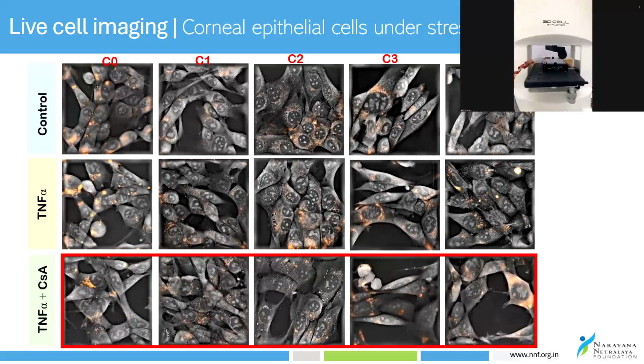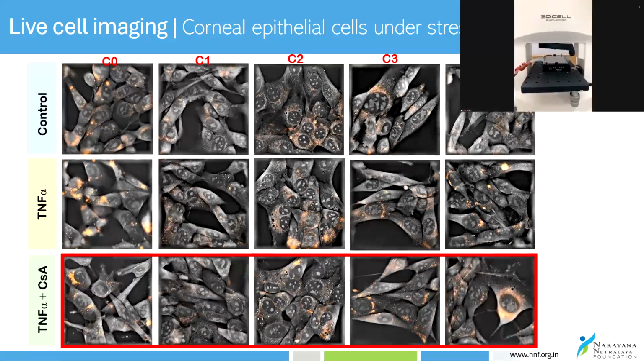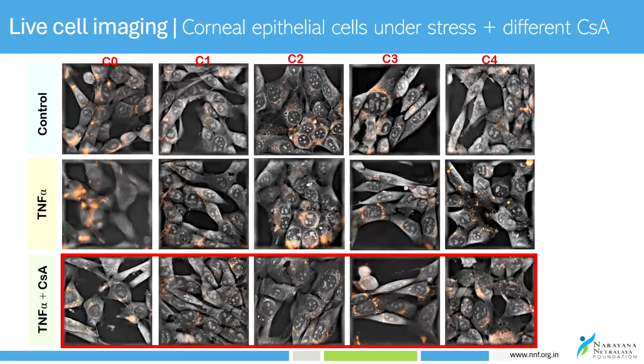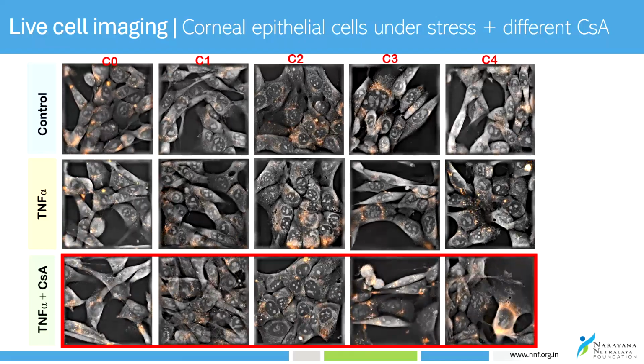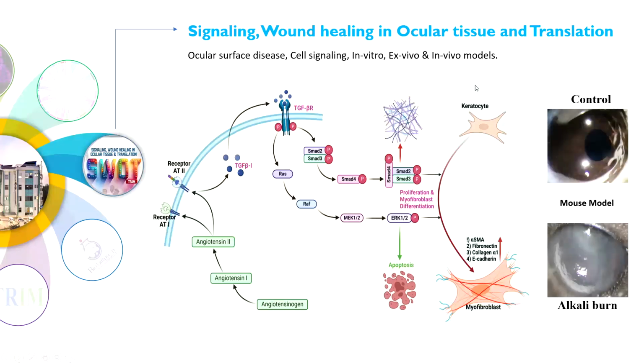The Nanolive on full screen, please. Those are called Nanolive imaging, and it has actually bypassed us working on animal experiments for many of these things, because now we can work in real time on real cells. We also have some retinal pigment cells. We have a very beautiful tumor, retinoblastoma cells.